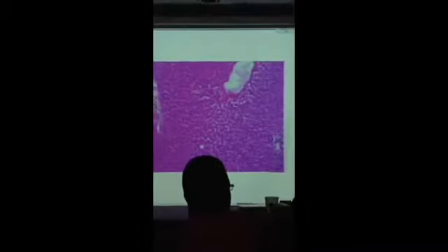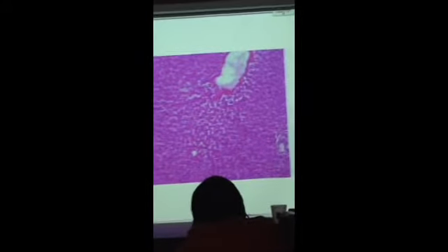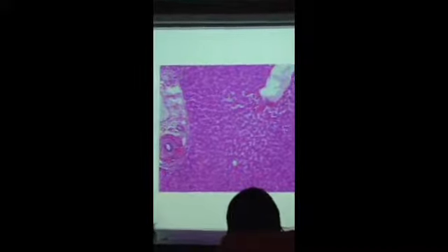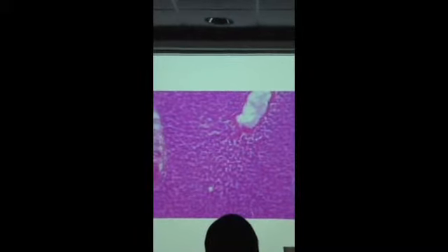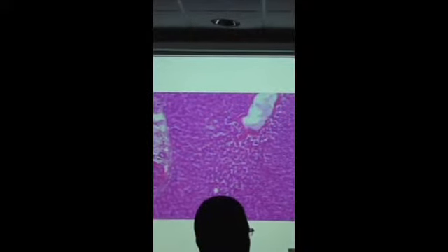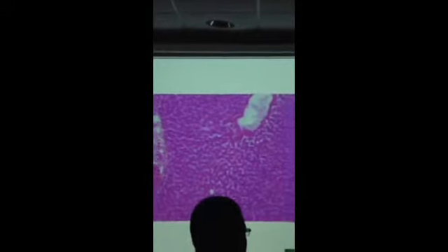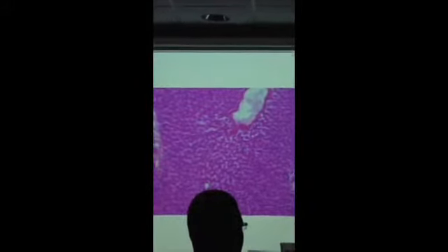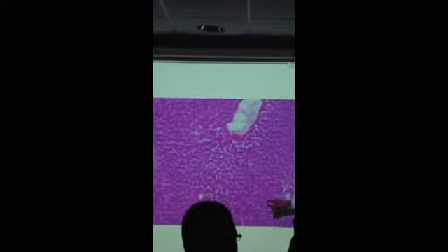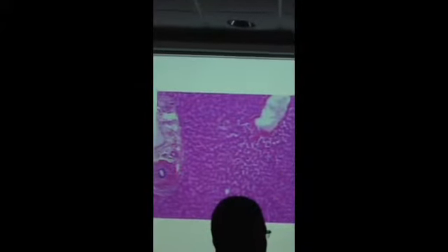In the red part of the spleen, they were called splenic sinuses, or we can call them splenic sinusoids, because they're sinusoidal capillaries. These capillaries tend to be larger than a typical capillary and very porous, very permeable, because there are big gaps between the cells, also called discontinuous capillaries. So large, in fact, red blood cells can actually cross the wall, which is unusual. Usually it takes a break in the wall for red blood cells to escape. White blood cells can squeeze out, but not the red blood cells. So one of the things the liver does is the same thing the spleen does, get rid of worn out red blood cells. By virtue of macrophages in there, they gobble up these blood cells passing through when they're worn out.